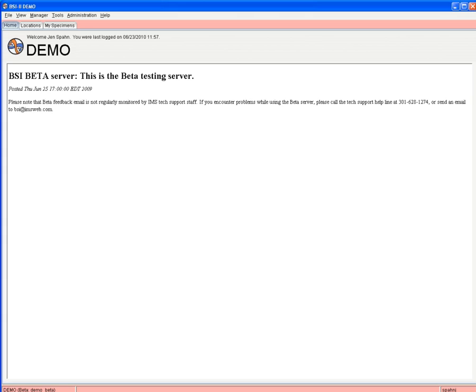We're going to go over the BSI EZ interface and changes to locations in this webinar. These changes were implemented to basically make the system easier to use for simple tasks such as withdrawing a specimen or adding one specimen at a time.